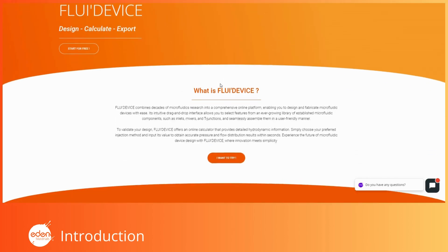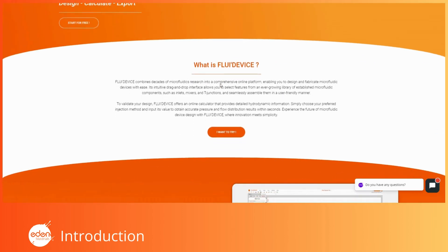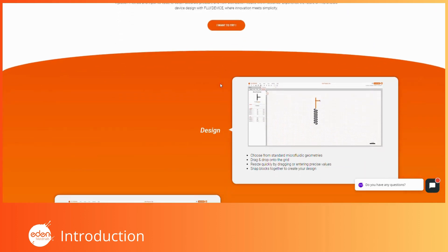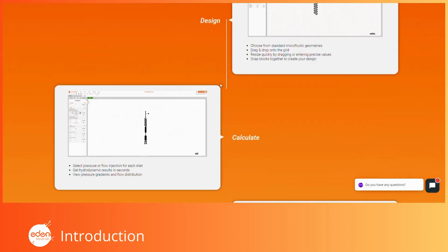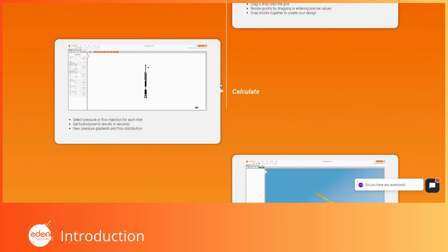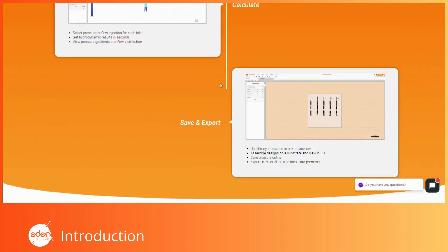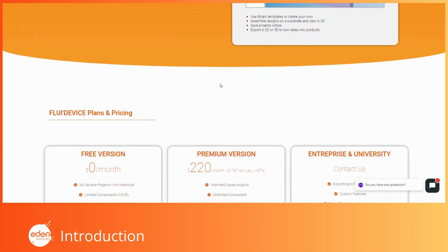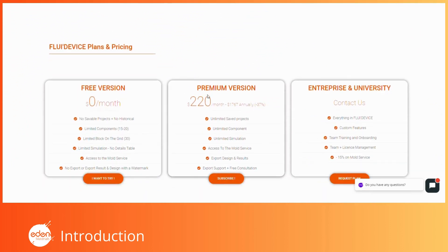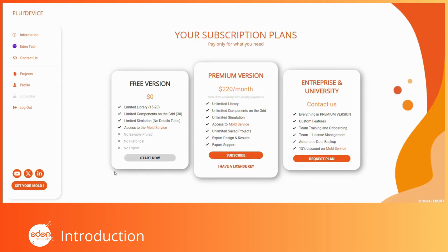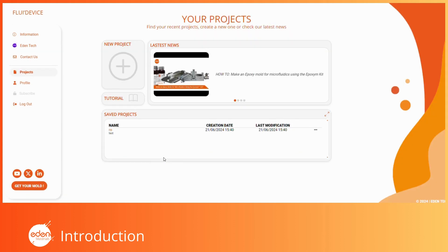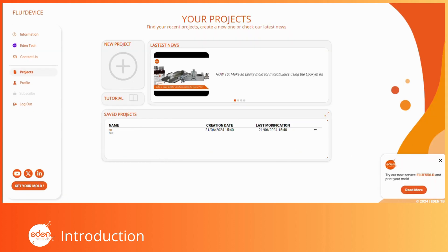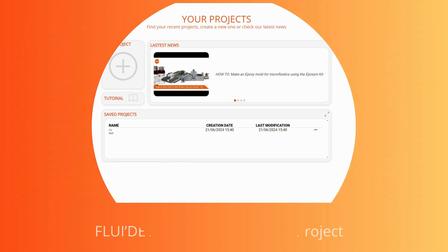Hello and welcome to this tutorial video on how to fully utilize FluiDevice, a product developed by Eden Tech. FluiDevice is an all-in-one online platform that helps you sketch your microfluidic designs, validate them with computational models, and export them as 2D or 3D files for microfabrication. Thanks to its user-friendly interface, you can accomplish all this in just a few minutes. Follow this tutorial to make the best use of all its functionalities.